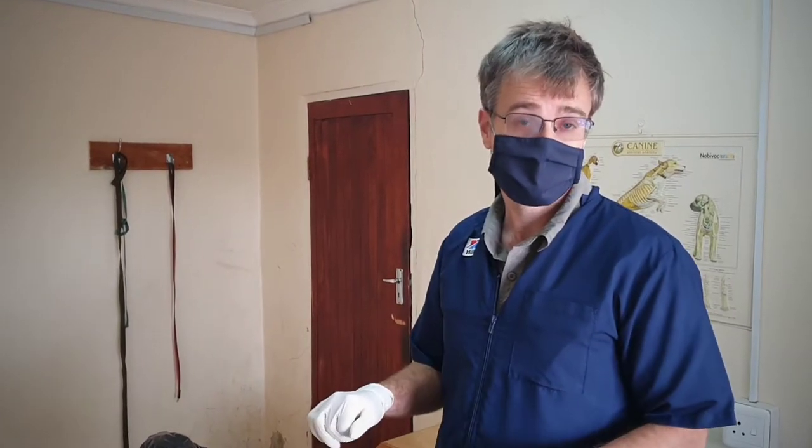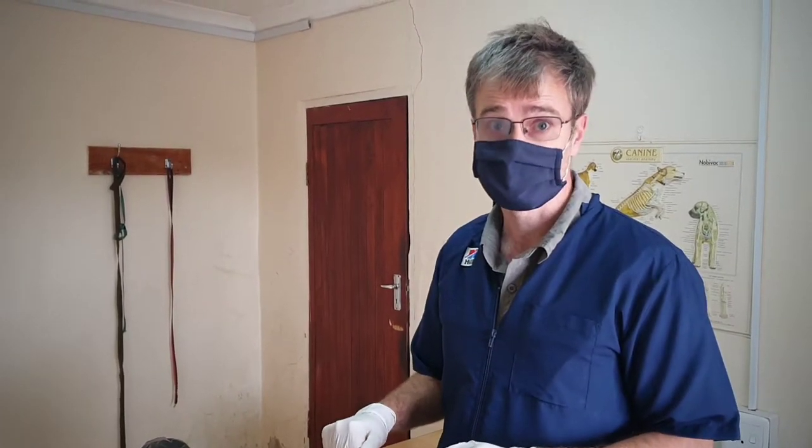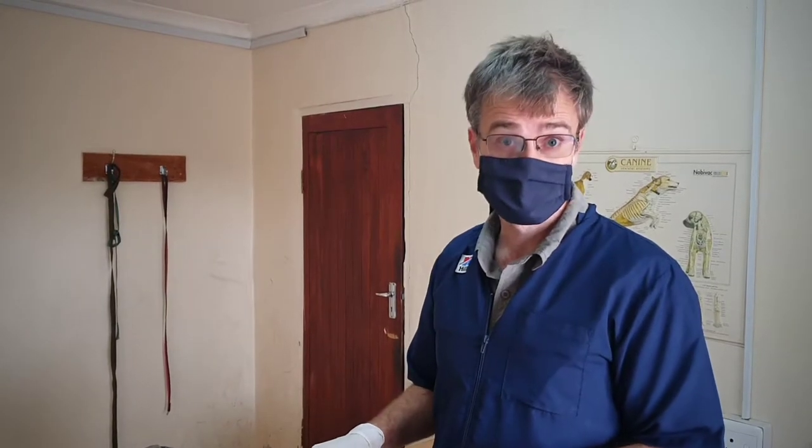Okay, you're recording. So what we're going to do quickly is just show you a quick demonstration of the straw technique that you've been using for taking your brain samples from dogs in the Nelson Mandela Bay metro area.